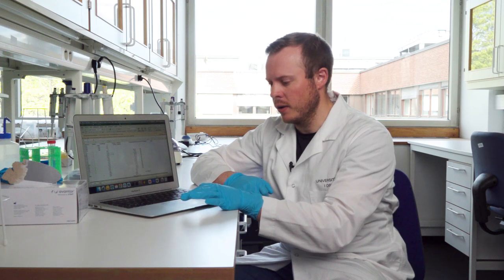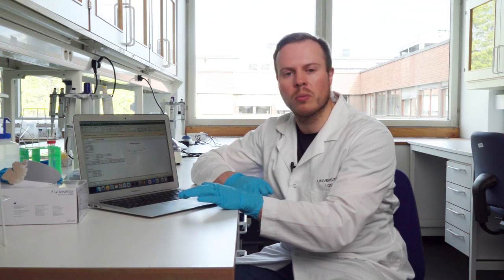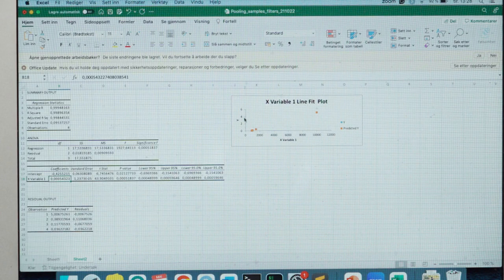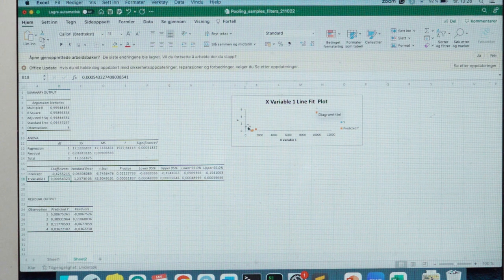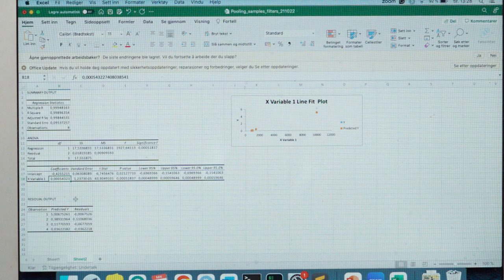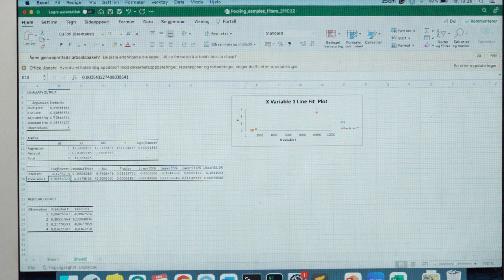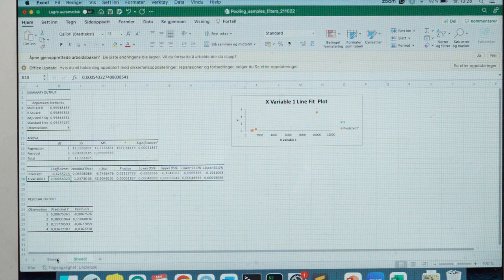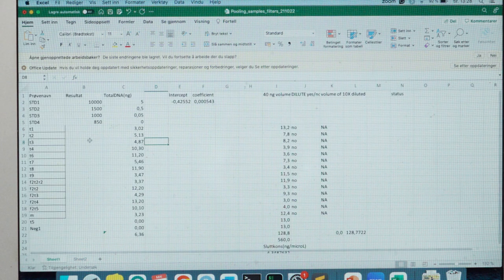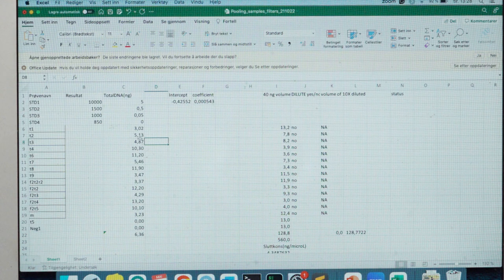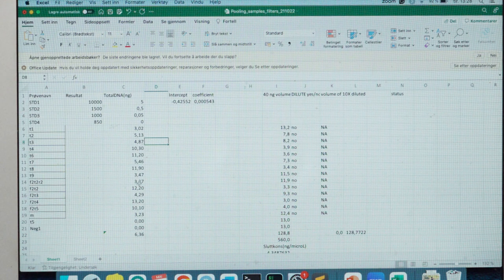So here I have on sheet number two made a small linear regression with the points, and I have gotten out two coefficients. I use these coefficients that are here in the first sheet to calculate the amount of DNA based on the fluorescence.